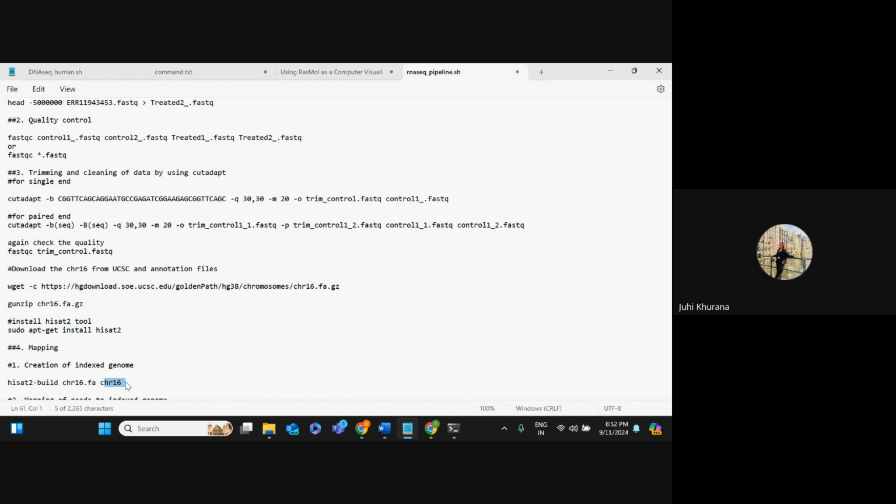It's done. Can you show me those binary files? Ma'am, I'm working on a different Linux system. Okay, you are working on a Linux system, na? So it's no worry. Ma'am, I'm actually attending this meeting in Windows and working on a Linux system. Okay, that is on a different system, fine, totally fine.